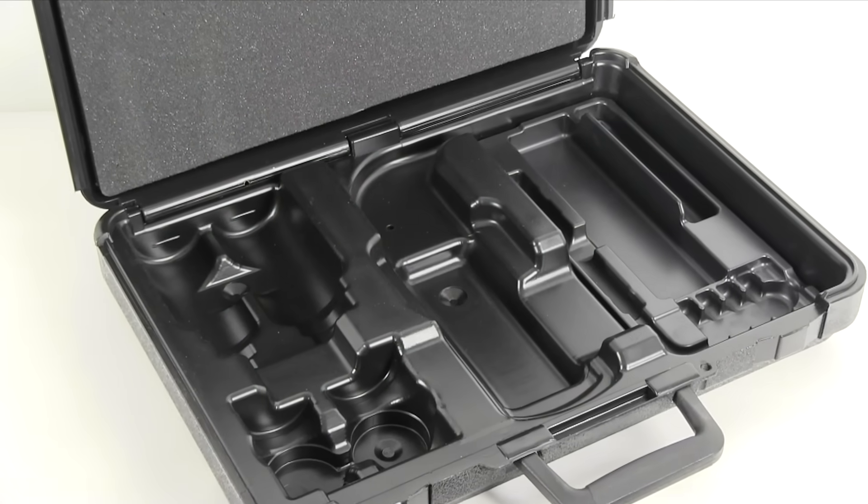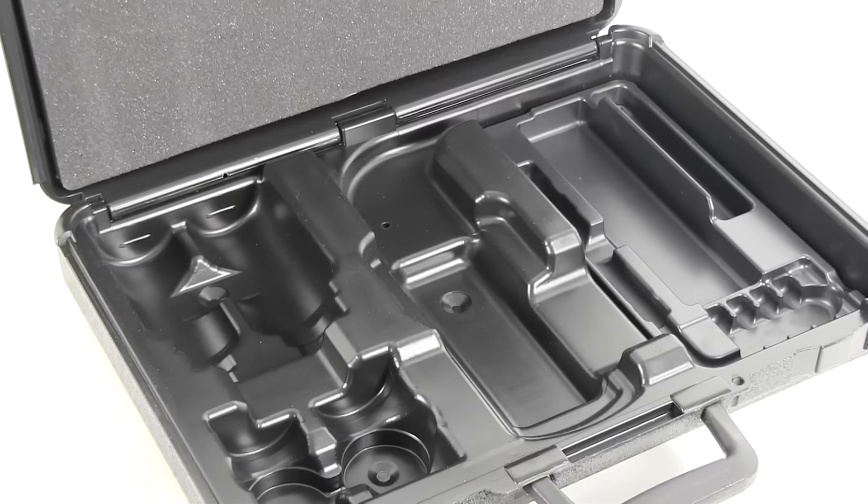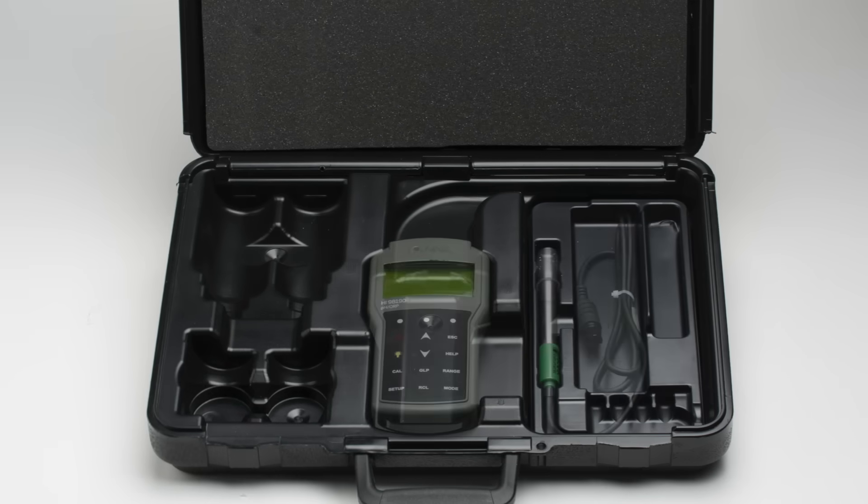Both meters come packaged in heavy-duty rugged carrying cases that are thermoformed to secure the necessary components for routine measurements. In each case, along with your meter and probe, the following materials are supplied.